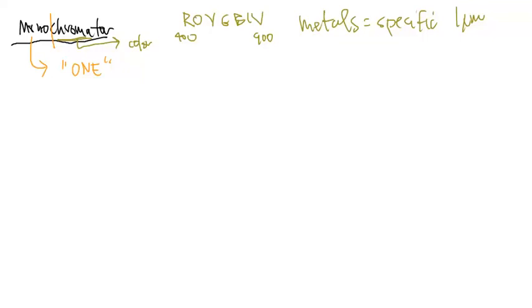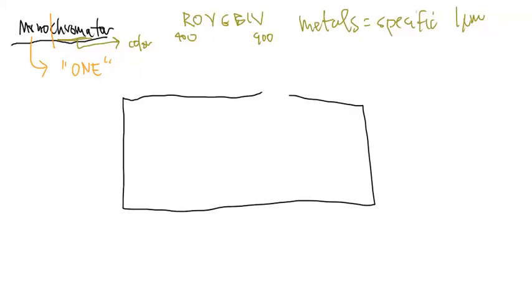All right, so let's draw the monochromator box. Typically what you'll find in a schematic is that a monochromator is a black box, and there's an entry and there's an exit. Light goes in and light comes out. The problem though is what happens to the light inside of the box. Inside, typically you'll find a couple of mirrors, and I'm going to draw one here and one there.